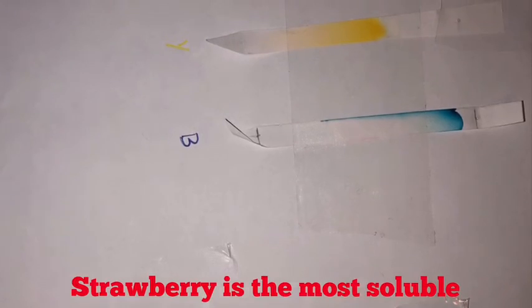to 1. In conclusion of this experiment, isolating dyes in homogeneous mixtures was successful by the technique of paper chromatography to identify the components, purity, solubility, and polarity of a specific mixture.